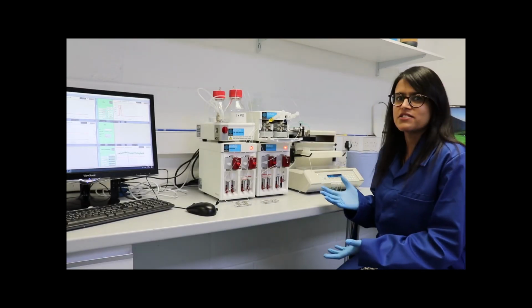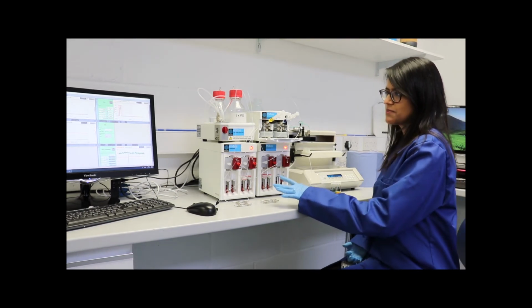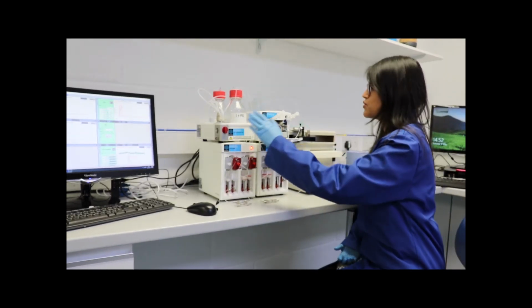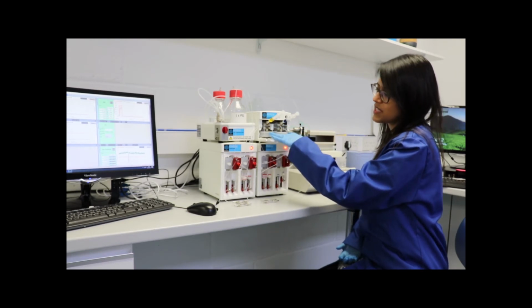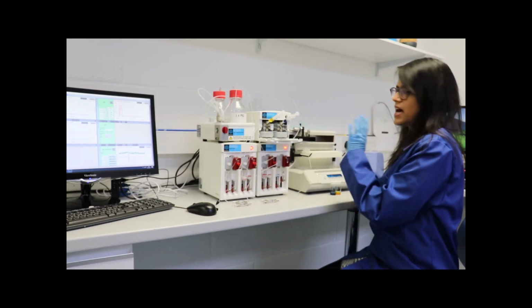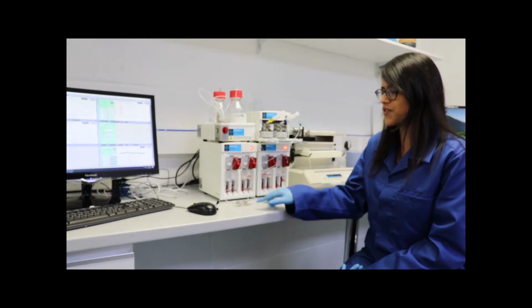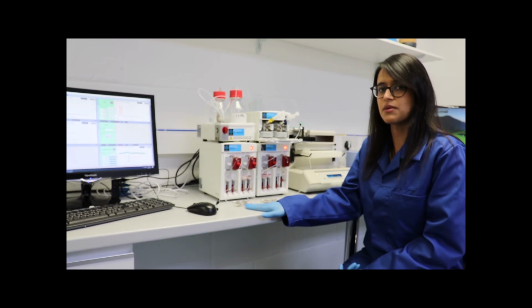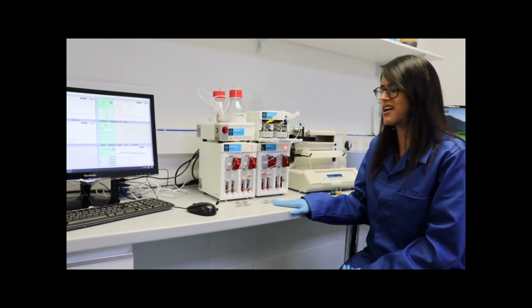So I'm going to show you how the system works. We've got in front of us 2 Mitas quad pumps, a pressurized input store, the automated sample valve with the sample loops attached, in this case 5 ml, and our automated collector. We've got the 2 microfluidic chips. The first one will do the hydrodynamic flow focusing, and the second one can introduce an optional dilution step.